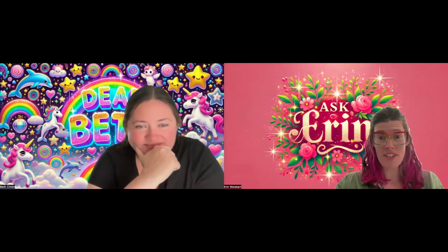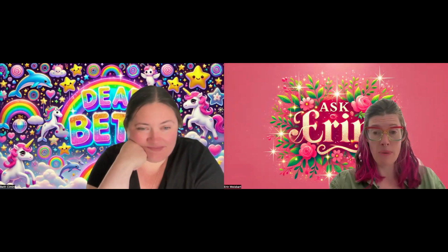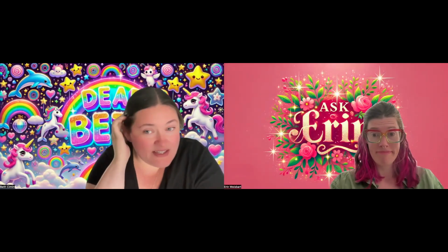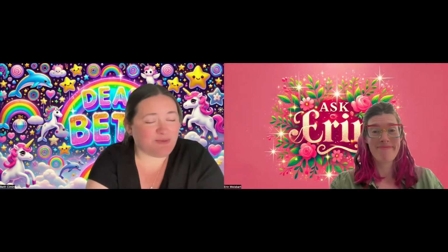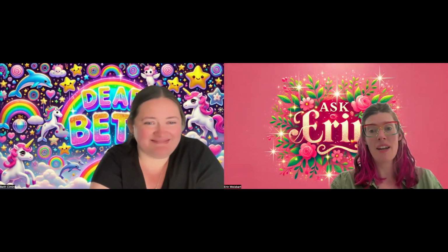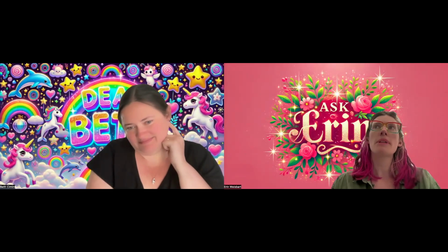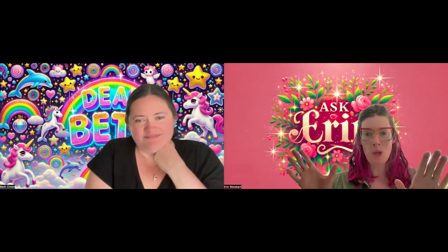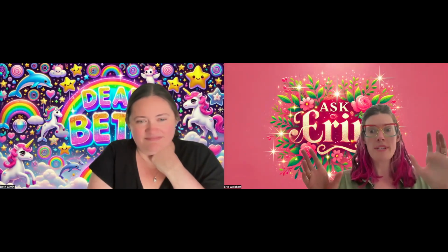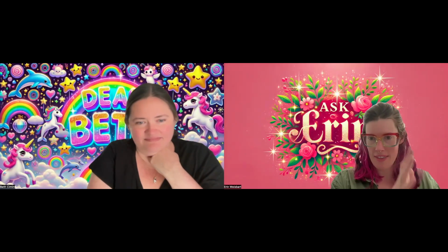That's what I had to show about getting those objects into a pipeline and doing something with them. That seems great because then you can make sure that when somebody tries to compare how they measured something to how you measured something, that we're all measuring the same thing, and that's really important. Yes, absolutely. And a really handy thing, hopefully pipelines themselves don't get lost, because the same CellProfiler pipeline will always identify the same cells in the same order.